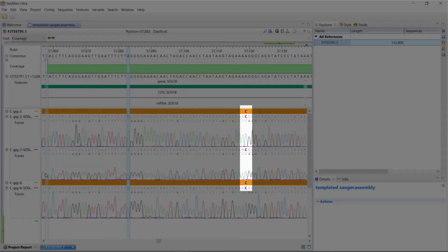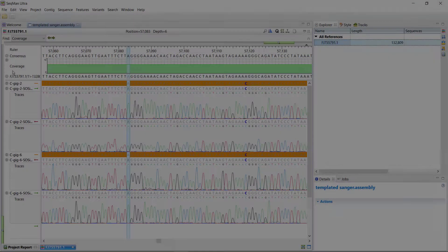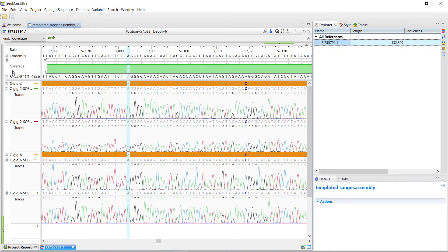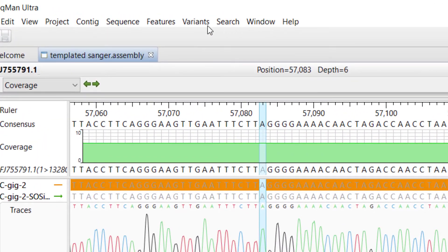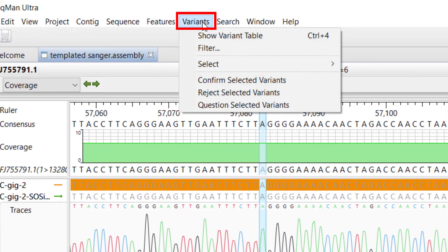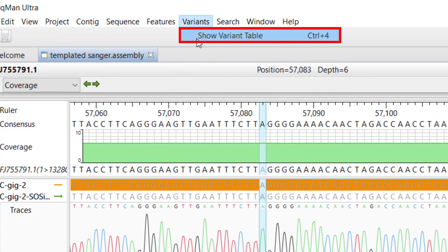The blue text indicates variants from the reference sequence. To see a report of all variants in the assembly, select Variants, Show Variant Table.